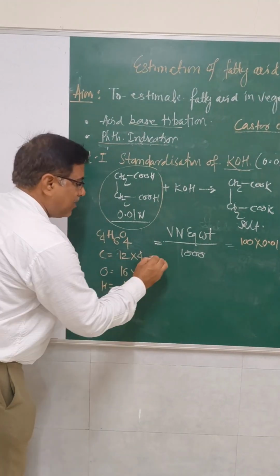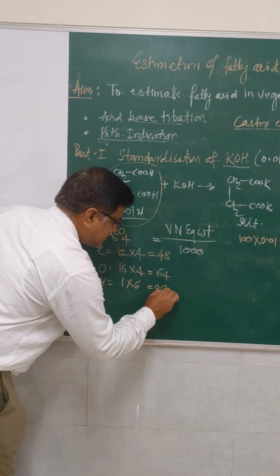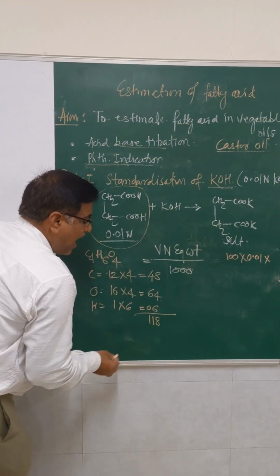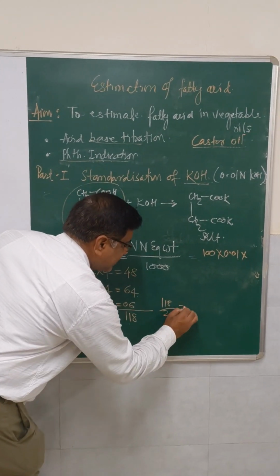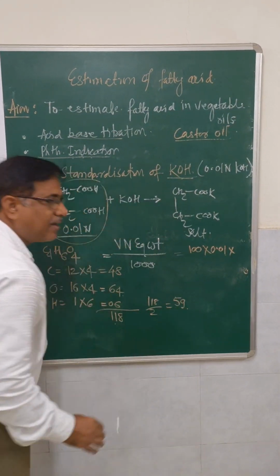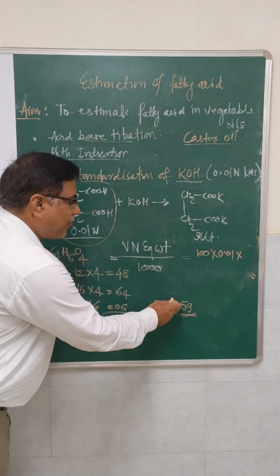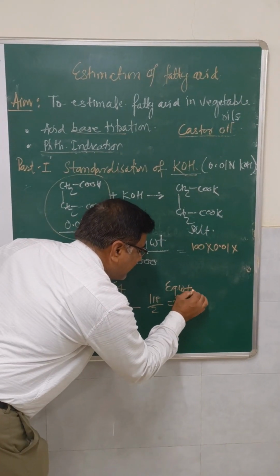This is 48, 64, 6. ऐड करो कितना हो जाएगा ये? बराबर 118. अब ये 118 तो इसको डिवाइड बाय 2 कितना हो जाएगा? करेक्ट. नाउ व्हाट इज द मीनिंग ऑफ दिस? मैं इसका मतलब आपको समझा देता हूँ. ये 59 का. ओके, तो 59 का हम लोग क्या करेंगे? दिस इज योर इक्विवेलेंट वेट. ये आपका आ गया इक्विवेलेंट वेट.